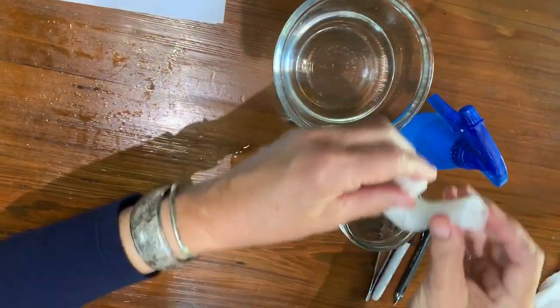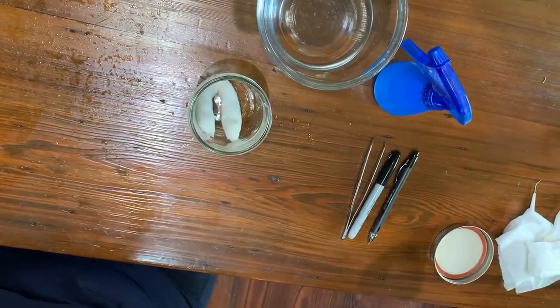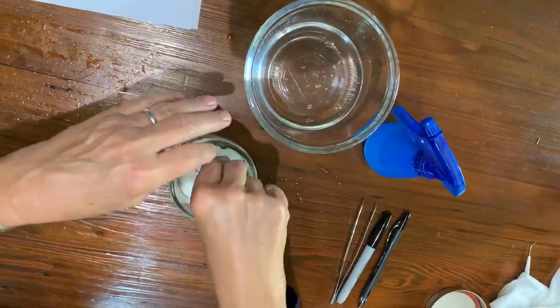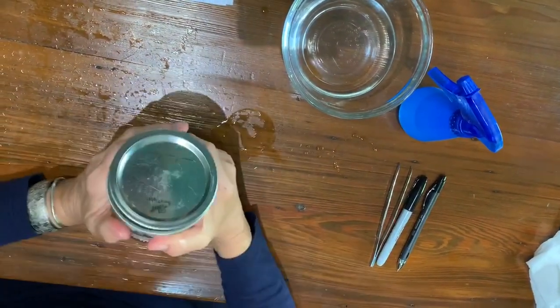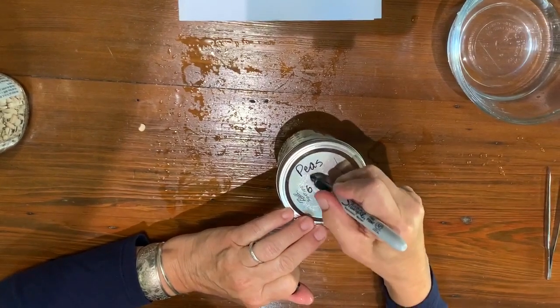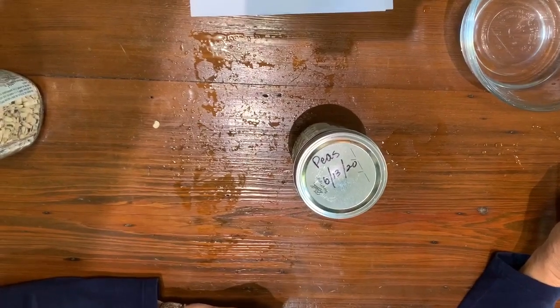I'm going to fold this and put it in a jar. I'll also put another wet paper towel in it just to make sure this doesn't start to dry out, since there's a lot of air space in there — just some extra moisture. Then I'll seal that up and label the top with 'peas' and the date 6-13-20. We'll put this in the same place as the mustard seeds and come back to show you the results.